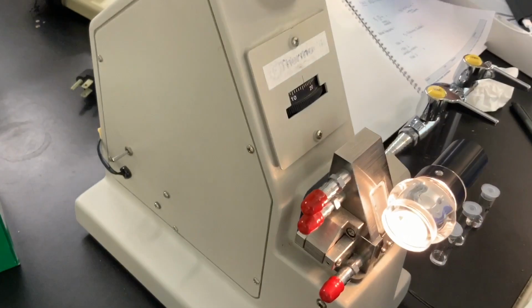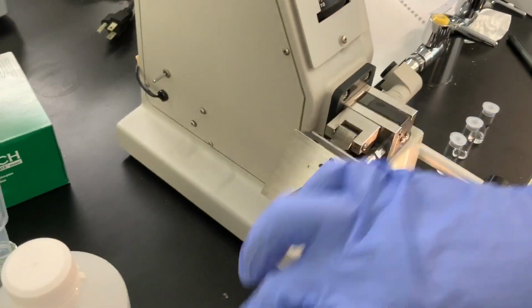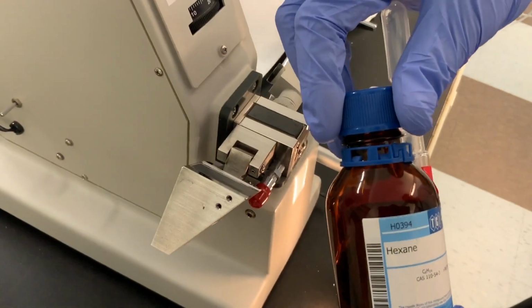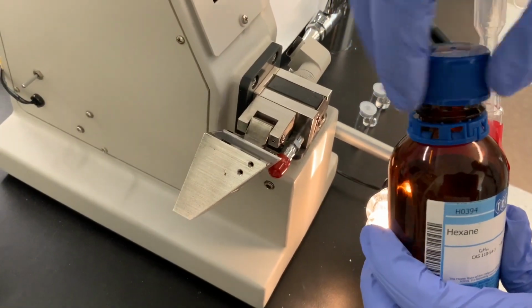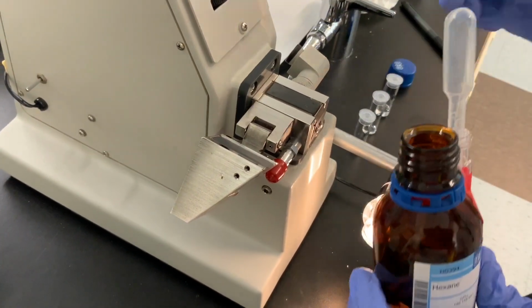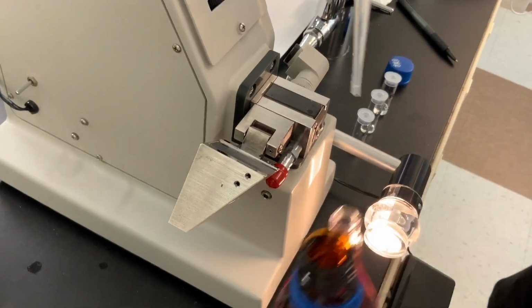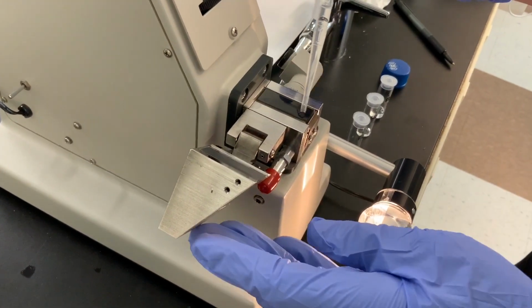All right, so I've got my sample area. This is going to be collecting the standard of hexane. And so now this is the sample area.